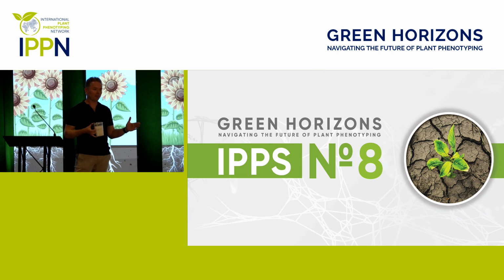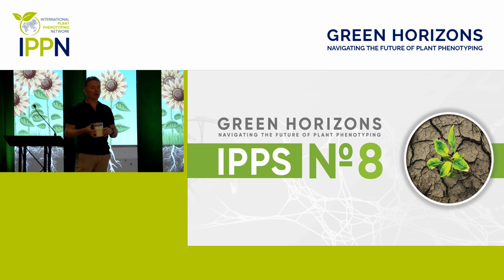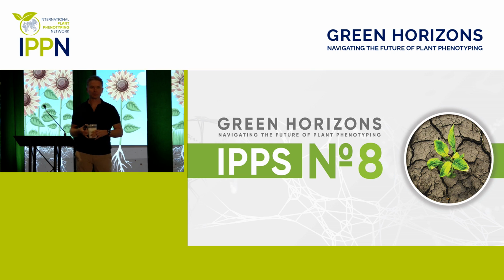but that depends, of course, on what the definition is of normal soils. We have had quite tricky soils where we were able to extract root systems pretty well. But if you have really, really tough soils, then it can be a bit more complex. And additionally, the water content that you mentioned is something that we also see can affect the segmentation, but it's all about the combination between crop, soil, and water content. But it's definitely important to look at the protocol to make sure that you can get the best results out of it.